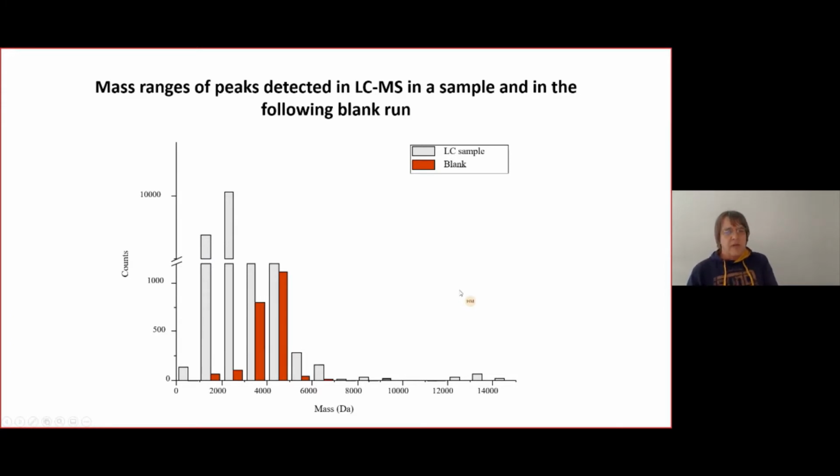And another advantage is that the CE capillary is quite simple and can be flushed after each run with sodium hydroxide at high pH basically, and this cleans up the entire system. There is no carryover. While if we run an LC sample and then we do a blank run afterwards, then we always find quite a lot of signal in the blank run. And this, of course, generates issues if we want to perform clinical analysis, because we cannot allow carryover from the last sample to the next one.